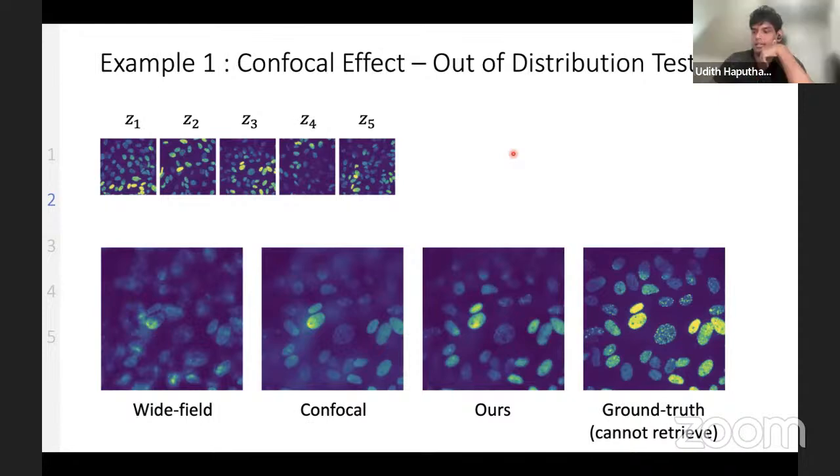I think I checked that, but I currently don't remember. As I remember, the confocal is more power efficient than ours, by less than an order of magnitude.